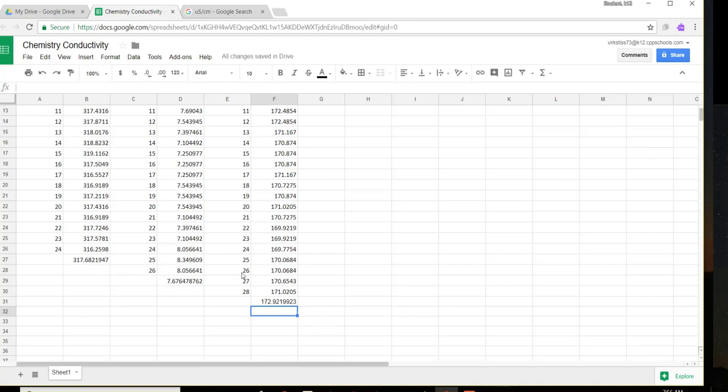You're going to be doing this 9 times actually, for each of the 3 samples. Another interesting thing, for our work, 1 decimal place would probably be good. So you can click on that number and go up here to the table, decrease decimal places, and let's just go to 1. That's probably good for our work. Let's take the average here and do the same thing.